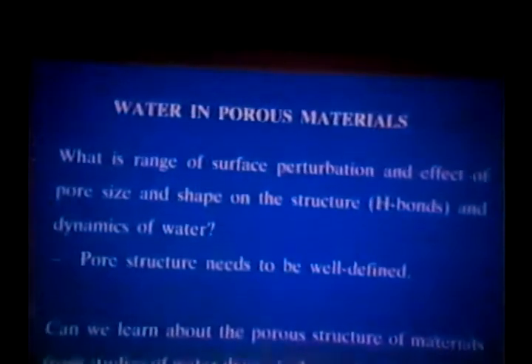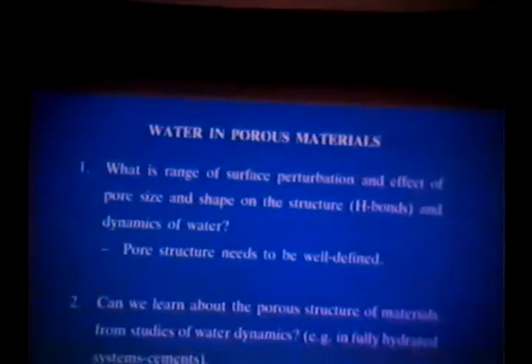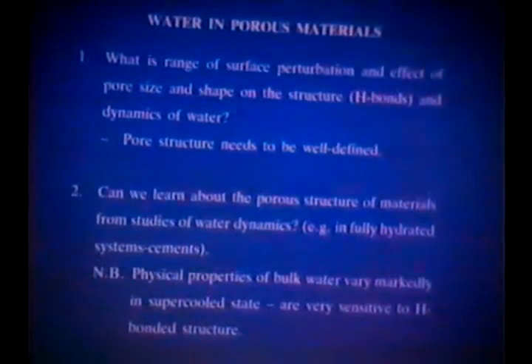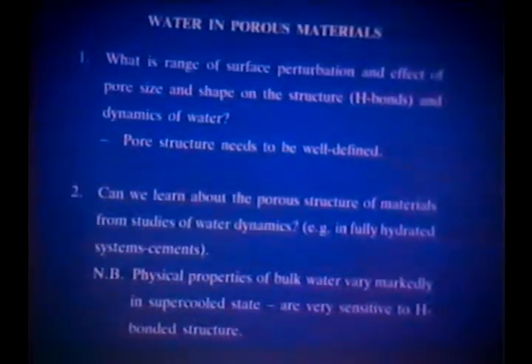So you might ask, why do we do this type of work? Well, I think we're interested in the range of perturbation of the silica surface on the water structure. Water saturating pores will be hydrogen bonded. It will have a long range structure, and one will be interested in the extent to which the surface can modify that structure. So we're interested in the hydrogen bonding, and to do that type of study, really one needs to have a well-defined pore structure to start with to draw any definite conclusions.